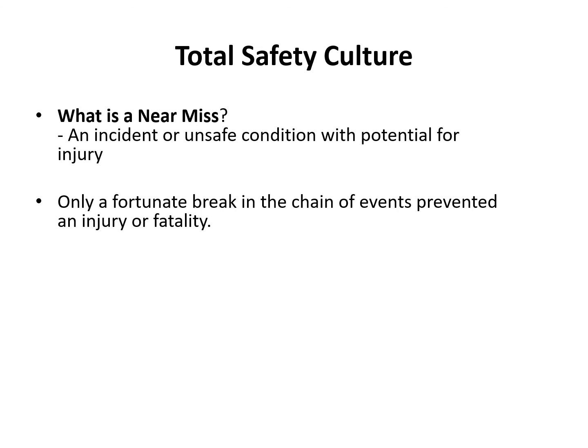The microorganisms are not very dangerous, but if you're working in the College of Medicine and dealing with blood samples, then it's another story. Overall our labs are BSL 1 or BSL 2, so not very dangerous, but if you know all this information, it will help you work safely in the different labs. Thank you so much, see you then, bye.